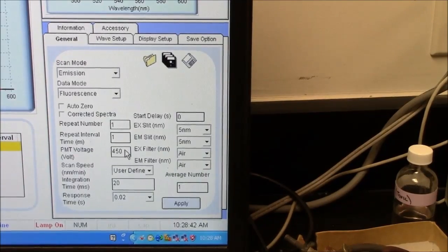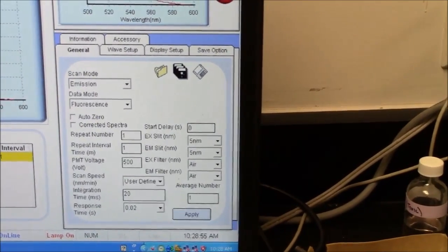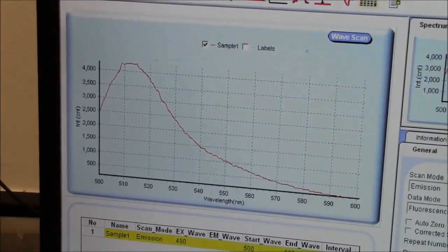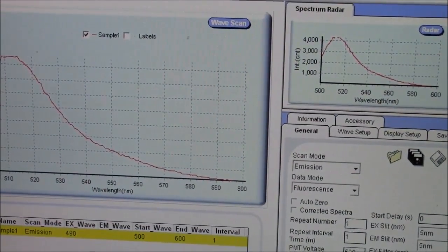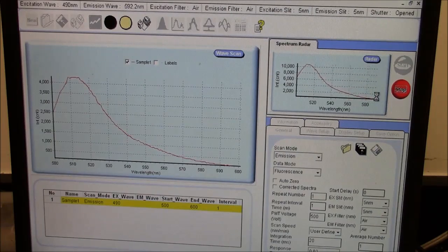To show you the idea of how the PMT voltage makes a difference, I will try 500, and we'll rerun the spectrum with 500 volts as the PMT. So this is like turning up the volume. My spectrum here is actually pretty good already. There's no reason for me to turn up the volume, but we'll do it just to show you what it does. Again, I click on start here. There, it's collecting its spectrum, and it will put that data onto my graph.